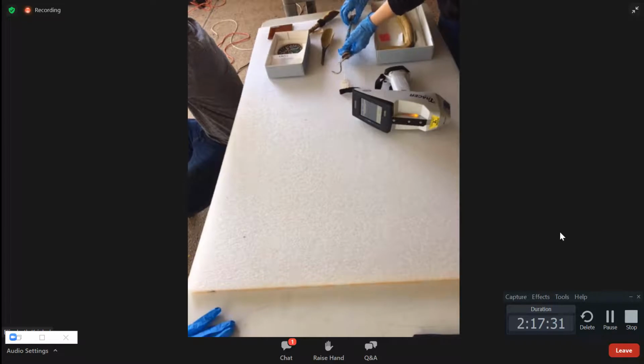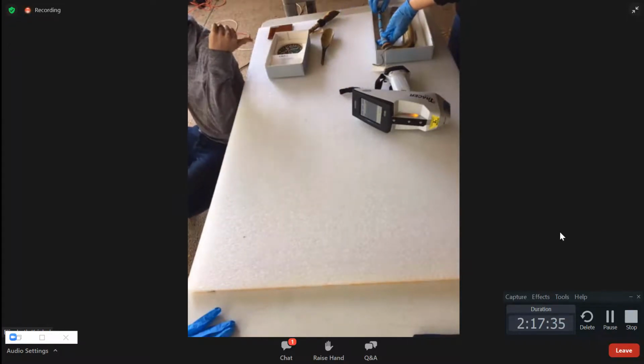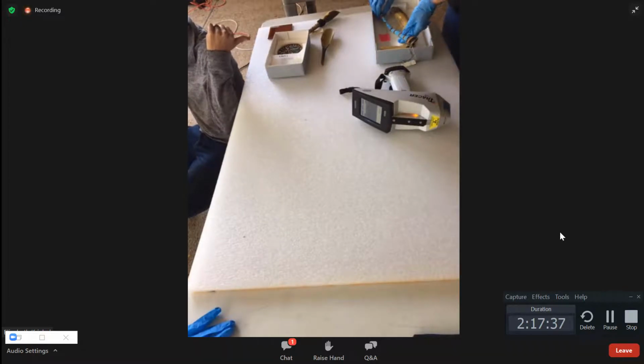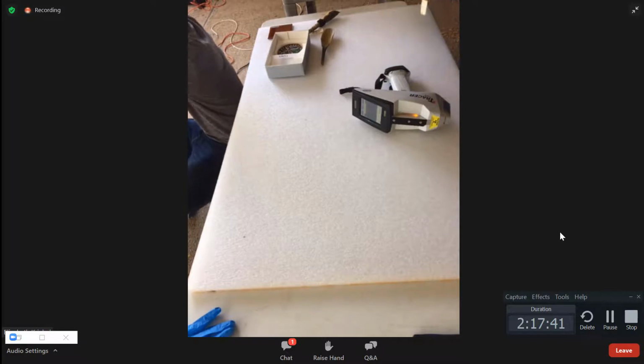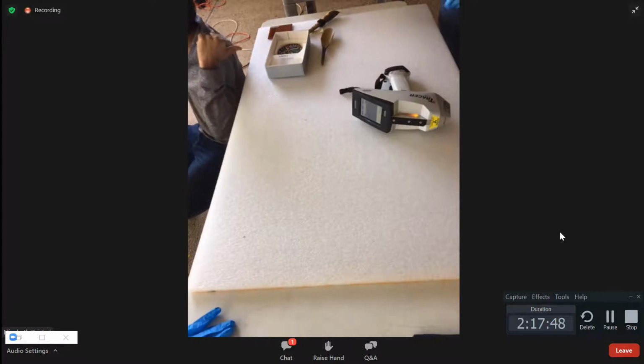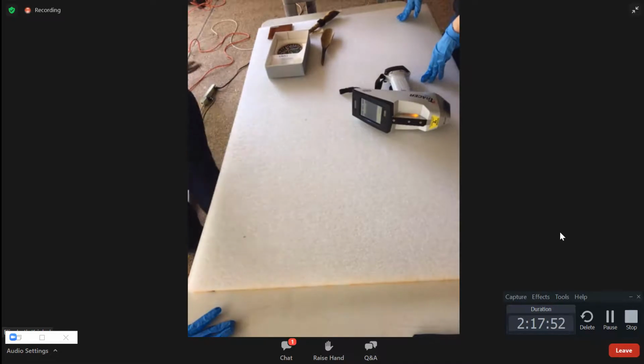Andy, can you tell us what the subject is over here? No, the one right behind me in the box here, the green one. Oh, that's probably a TP medallion, or sewing onto a TP. The long one was an awl. Okay. So the TP medallion was treated with mercury. Oh, really? Yeah. Okay. Oops.